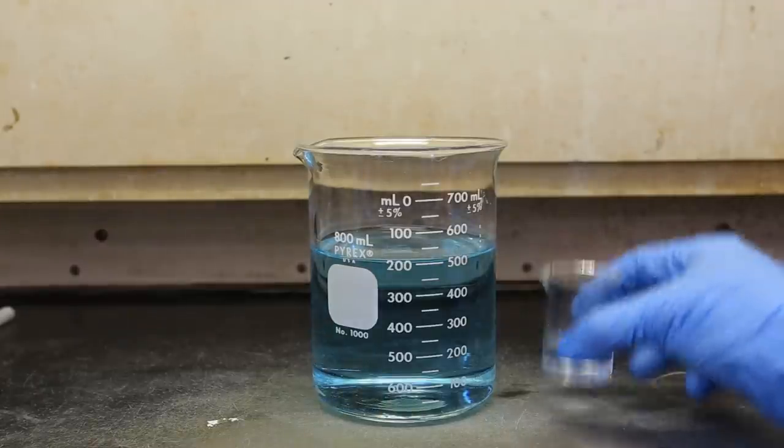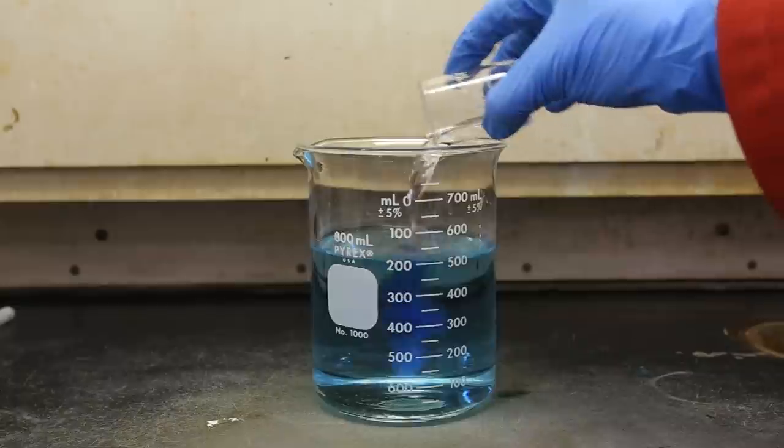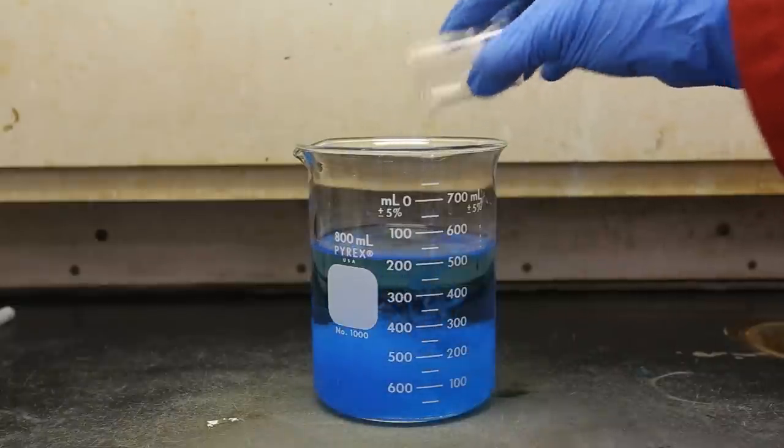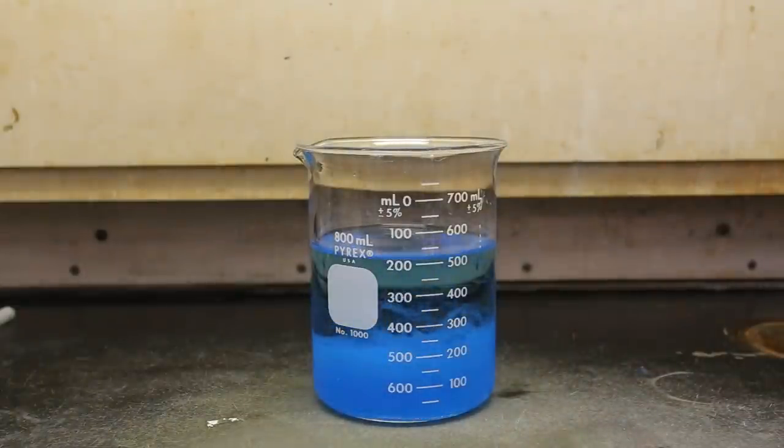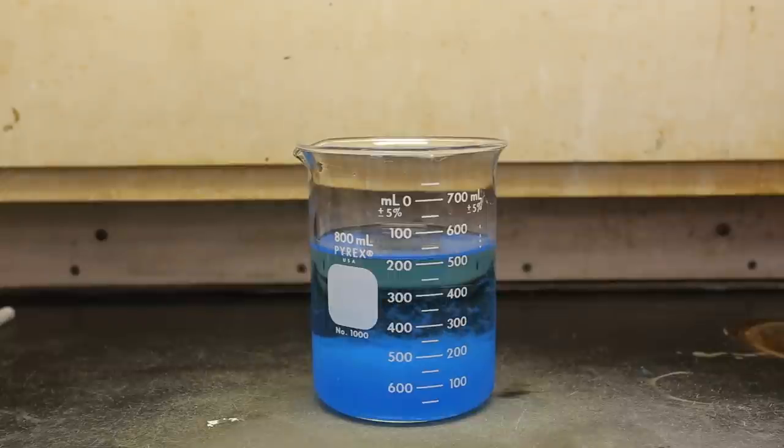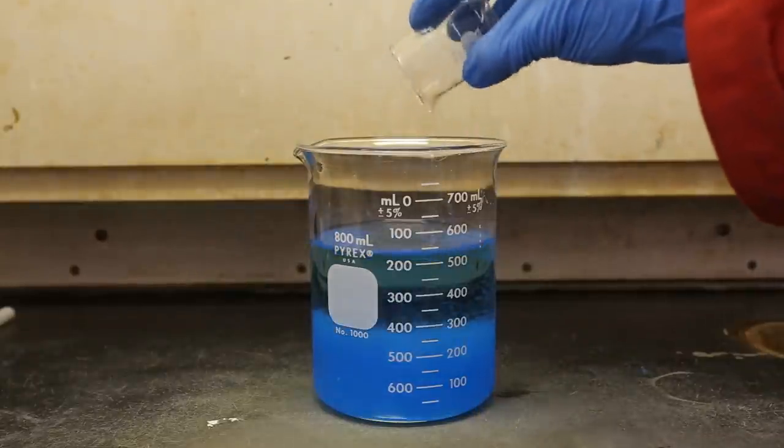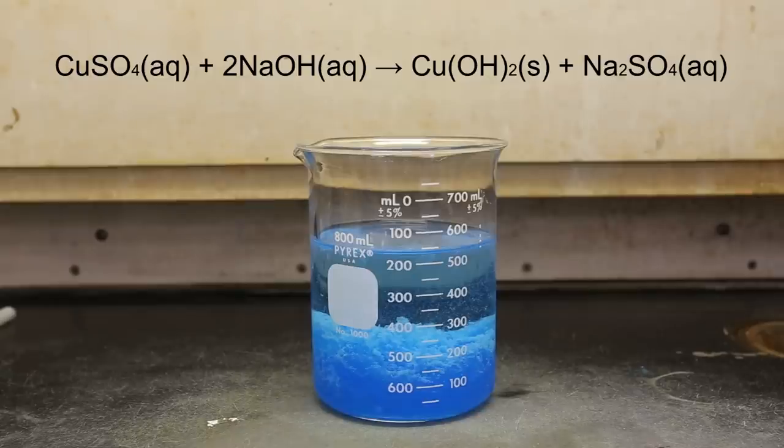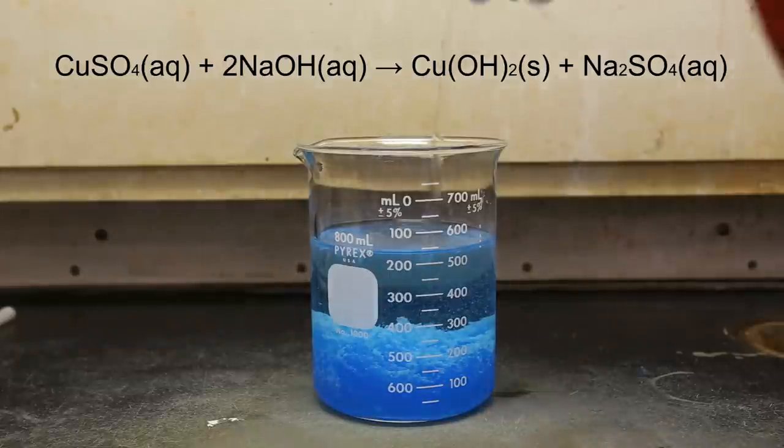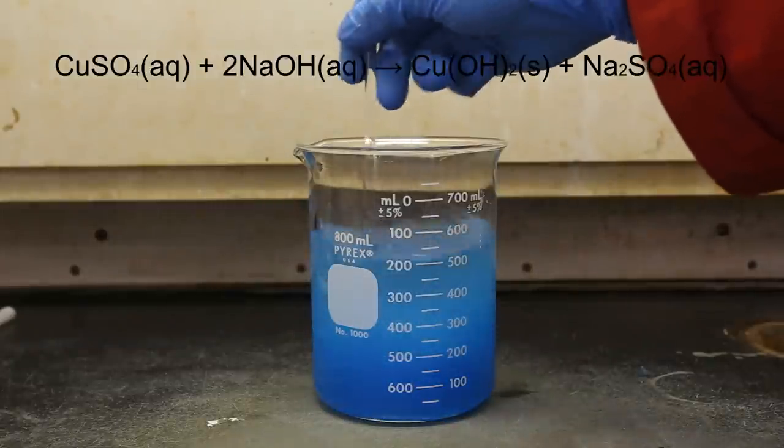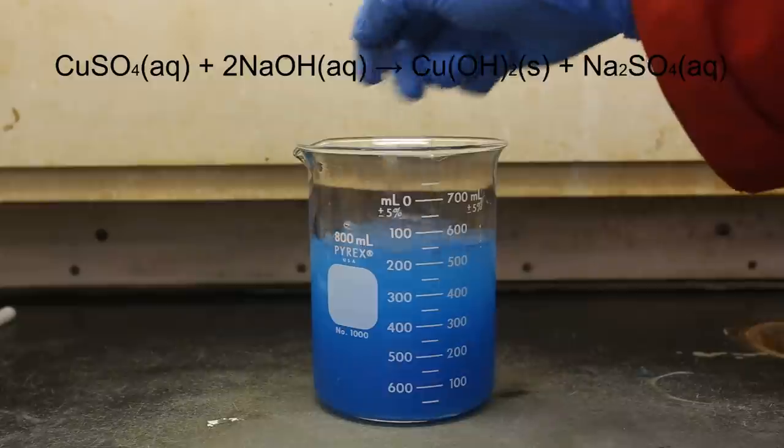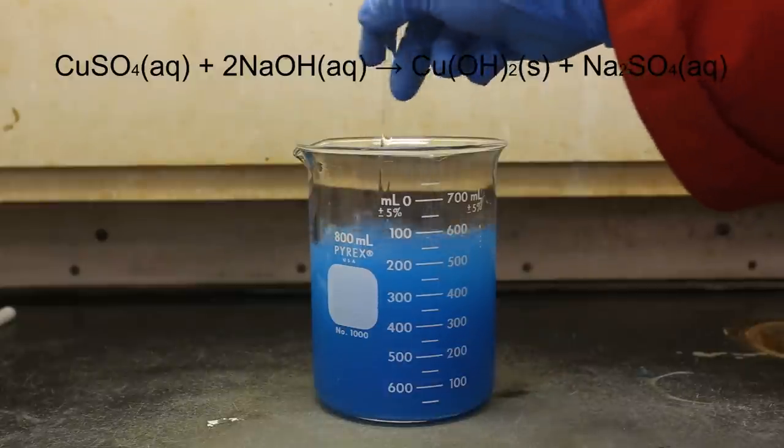Next, decant the sodium hydroxide solution into the copper-sulfate solution. Immediately, a nice blue copper-hydroxide precipitate should form. I washed the sodium hydroxide beaker with a small amount of water and added it to the solution. Next, mix the two solutions thoroughly. This serves to react as much sodium hydroxide as possible with the copper sulfate.